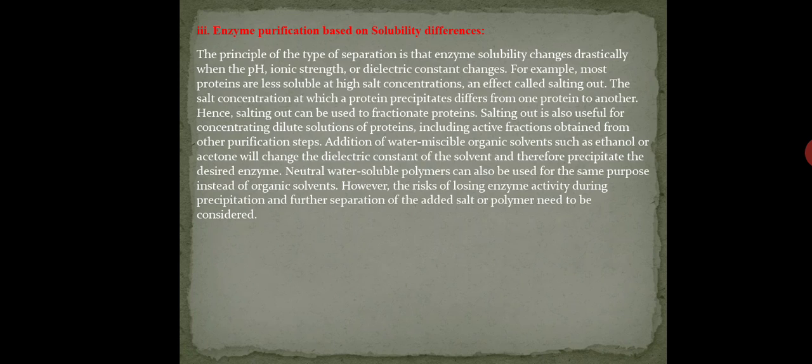Salt concentration plays a very important role in the formation or precipitation of the protein. As salt concentration plays an important role, it matters whether the salt concentration is low or high.